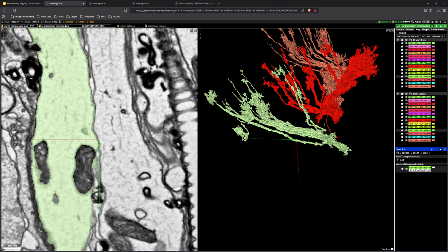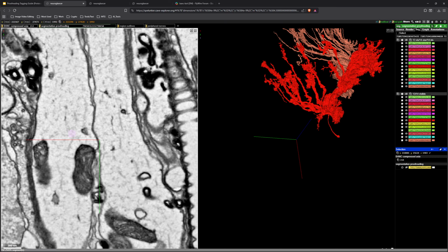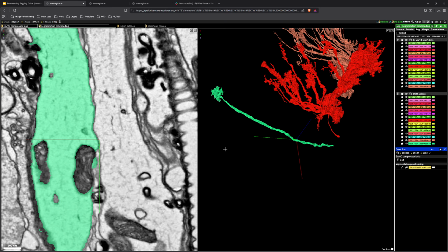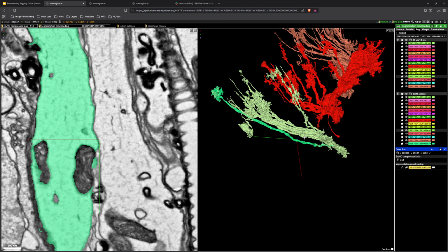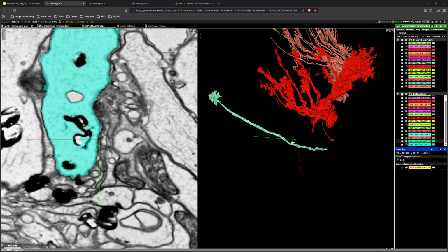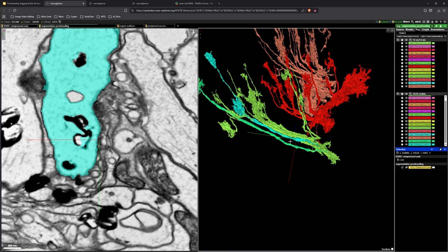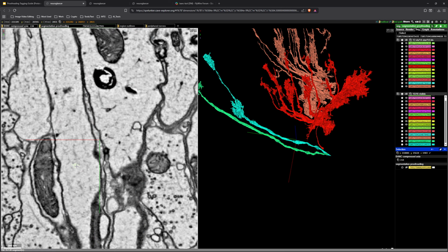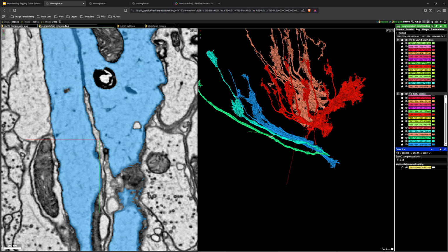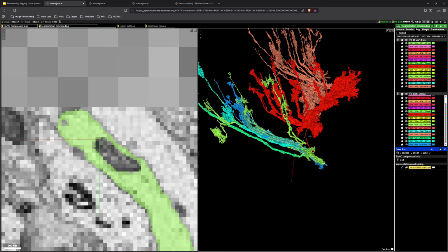separate apart all these specific neurons. So one strategy I suggest is you just start selecting and deselecting it. As you can see, we got one. This is the cell that it used to be. So we're just going to bring that back up. And we're going to keep doing this until we find all the cells that have been worked on. So it looks like we got a large cluster here. So that's probably where we're going to be working from.